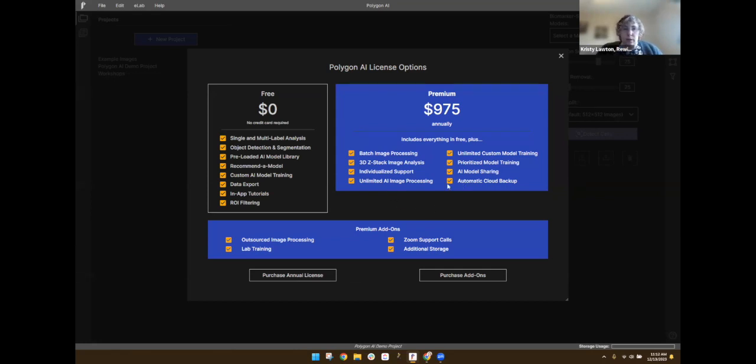In addition to a lot of these extras for premium license, we do also offer premium add-ons. If you want us to help you do some of your analysis or do some sort of lab trainings or additional Zoom support calls, things like that, we're happy to do things like that. If you click this link for purchase add-ons, it will take you to an email that you can use to ask what it is you're interested in purchasing, and we'll send you a custom quote.